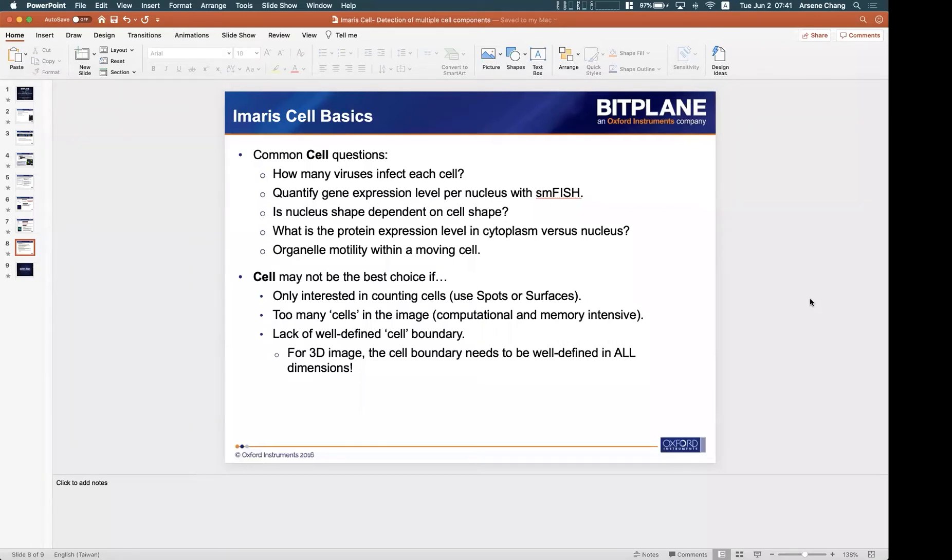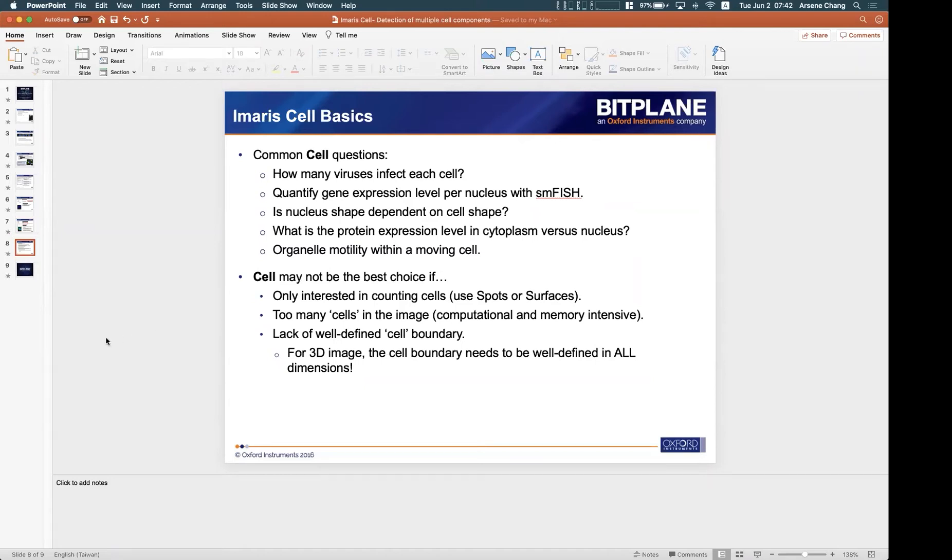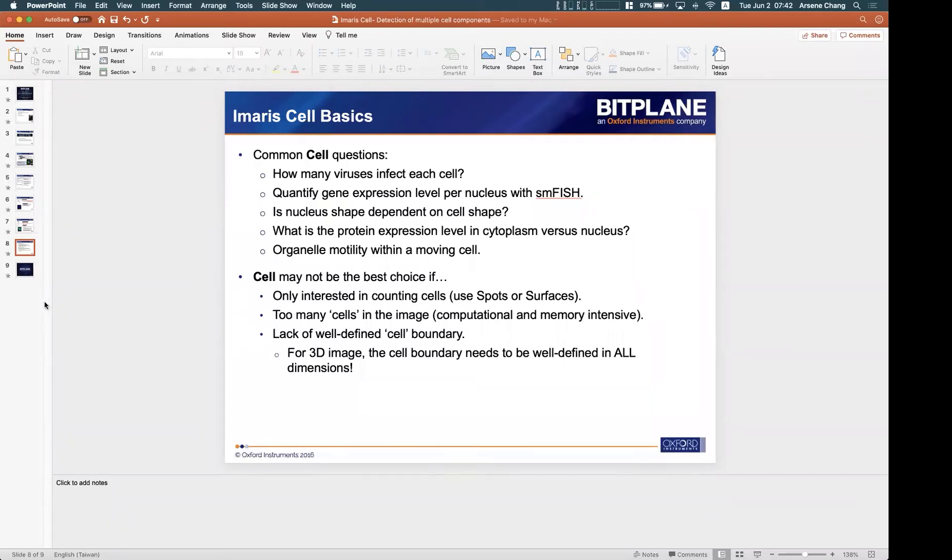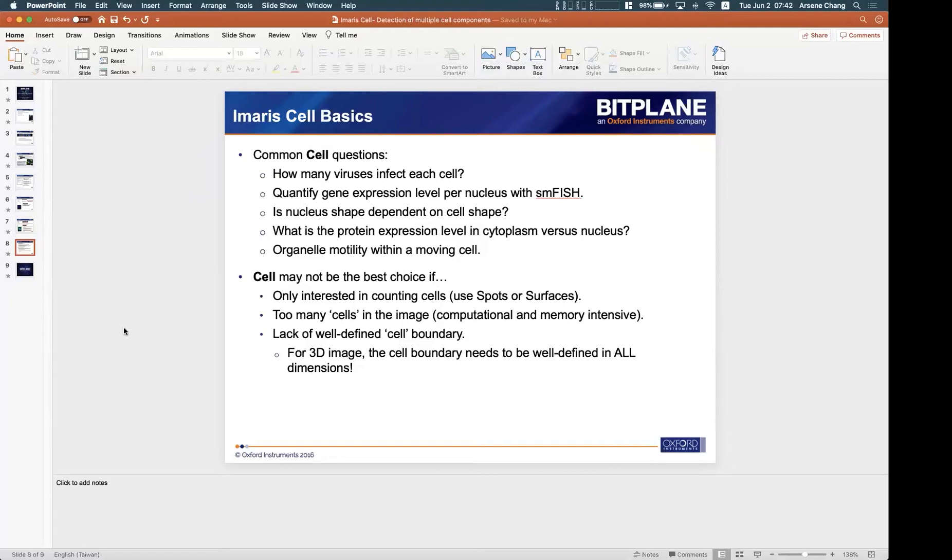So more than maybe 200, 300, 400 cells, only hundreds of cells on the image, then maybe it's not the best choice for analysis using cell module. But you can still try. It's hard to say because it depends on the image and the complexities of the components as well as the spec of the PC. So this is just a general rule: usually we see too many cells in the image, then cell is not easy to use.